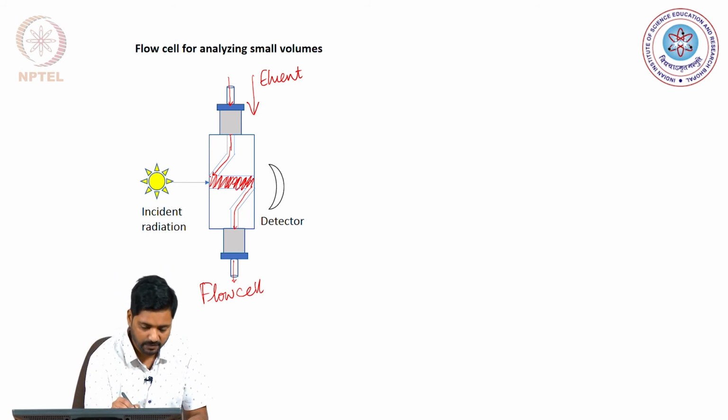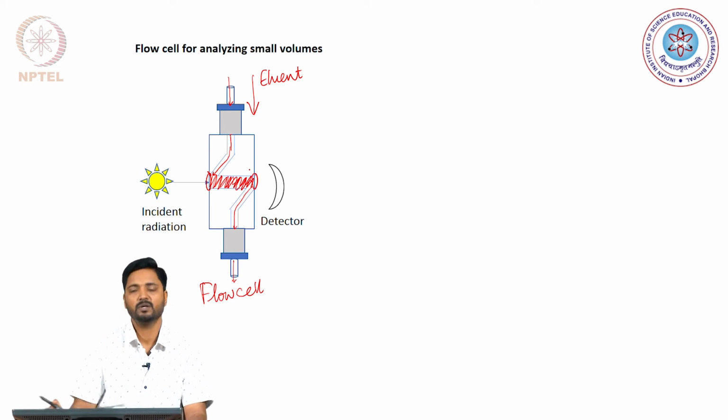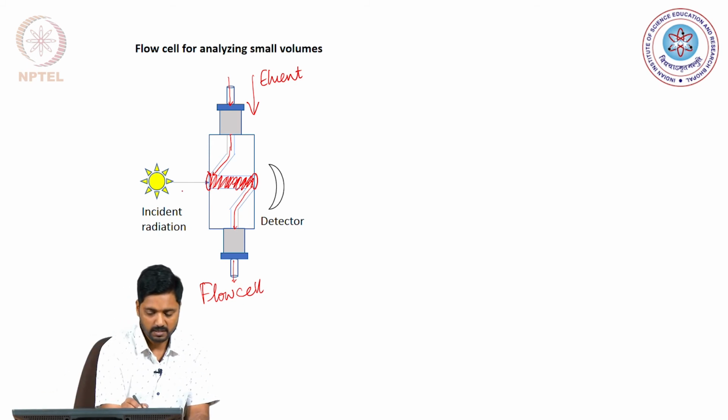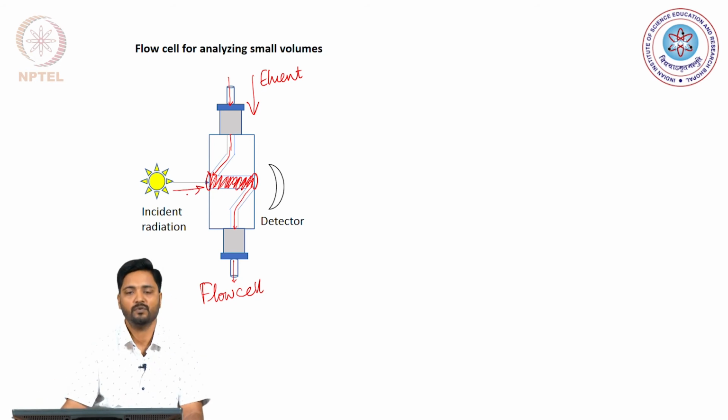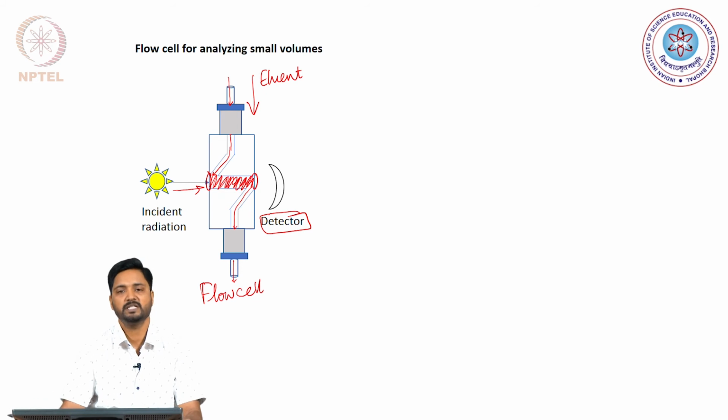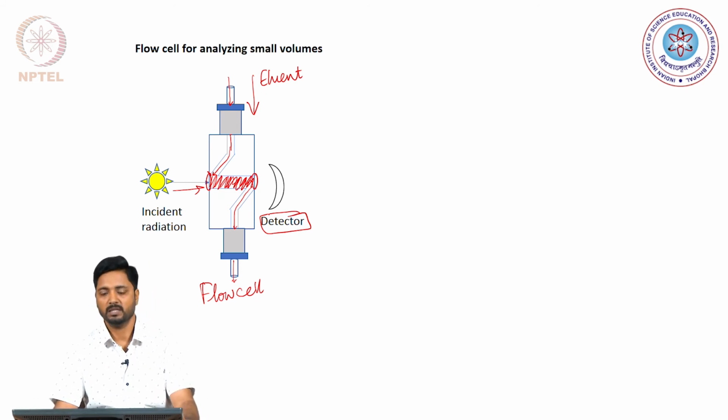For that, we simply have quartz windows at the two ends of this capillary, and we can pass the incident radiation from one side and detect the change in its absorption using a detector on the other side. Now, this is a design that can be utilized for multiple detectors.